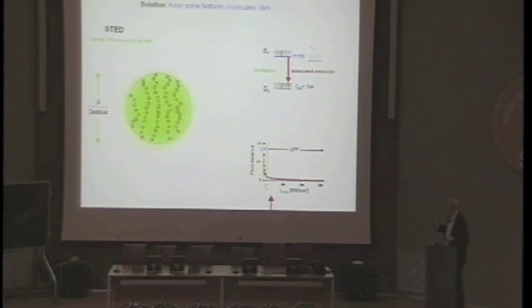But the molecules that are here in the fluorescent state can be instantly sent down to the ground state. So the wavelength condition is the number one condition for keeping the molecule dark, so to speak, with this phenomenon of stimulated emission. There's another condition that needs to be fulfilled.